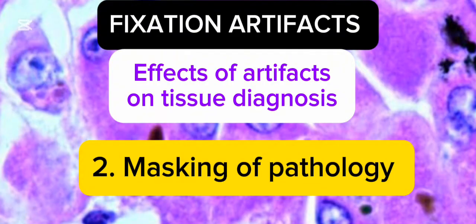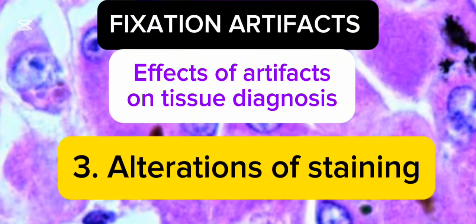Number 2, masking of pathology. Pigments or artifacts can obscure tissue details, preventing identification of true abnormalities like necrosis, fibrosis, or malignancy. Number 3, alteration of staining. Many artifacts interfere with routine staining methods, for example, the hematoxylin and eosin staining method, causing inconsistent or uneven staining patterns.